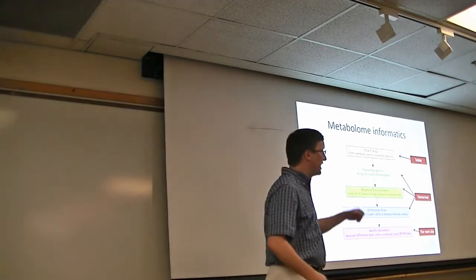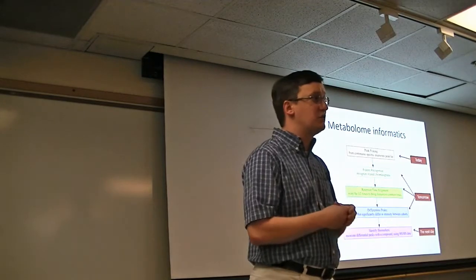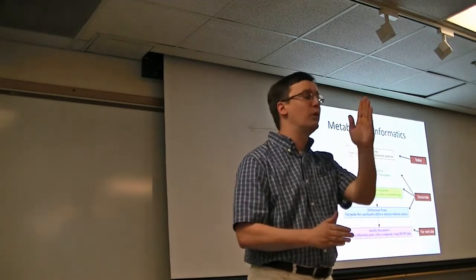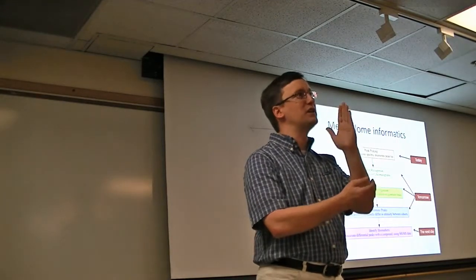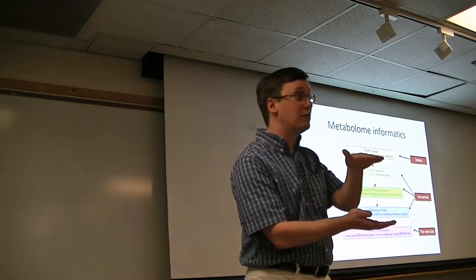So we start with peak picking, which is what ProteoWizard is going to be accomplishing for us. So if you have a profile of a peak, figuring out where it lies on what m/z value you can choose to represent it and put an intensity with it as well.